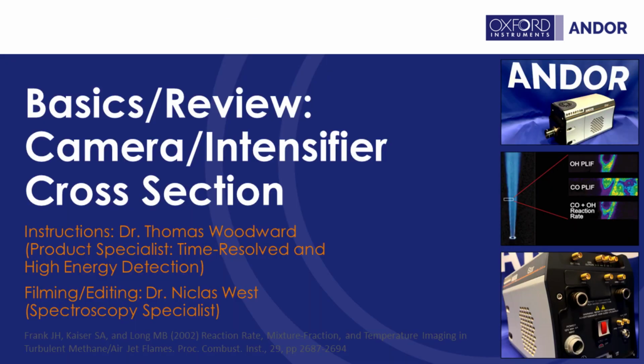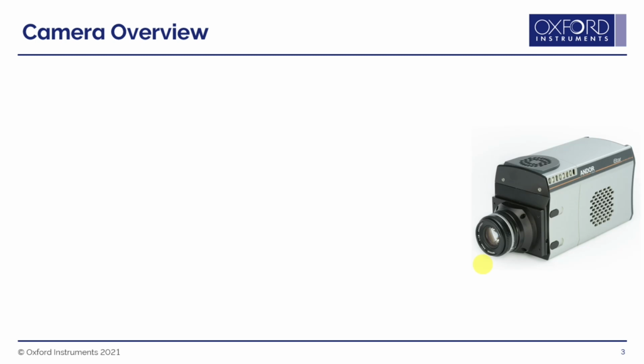Hello and welcome to this training session where we'll be talking about using the iStar sCMOS camera as the master to drive your experimental setup. So last time we talked, we gave a bit of an overview of the camera. I just want to reiterate that now because this will be quite critical when understanding the timings and features we're going to be discussing today.